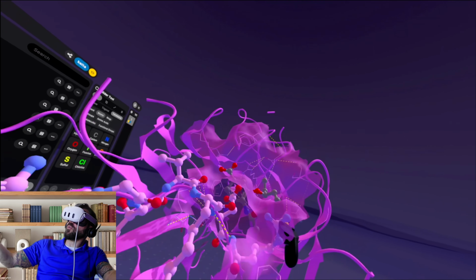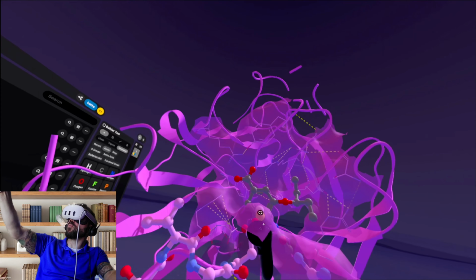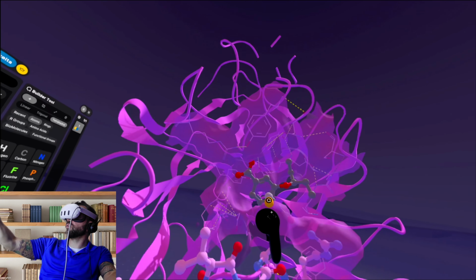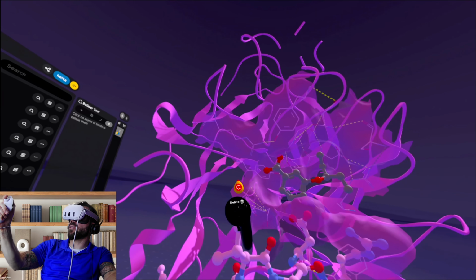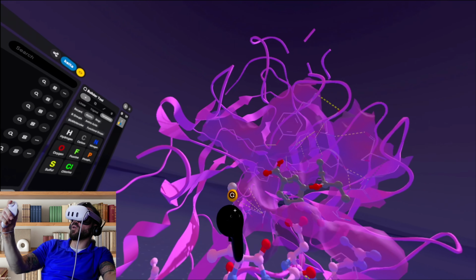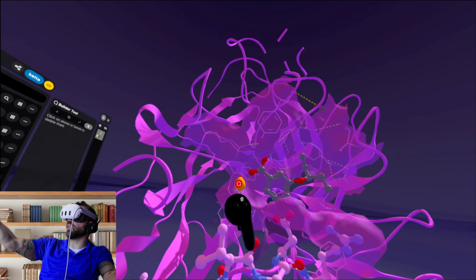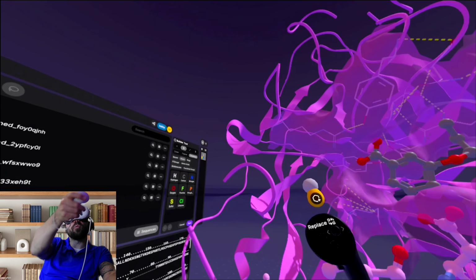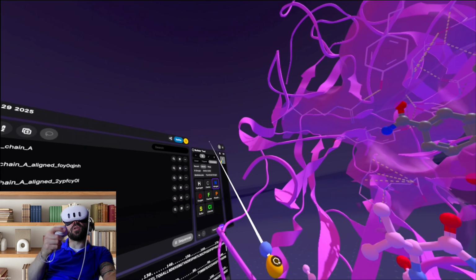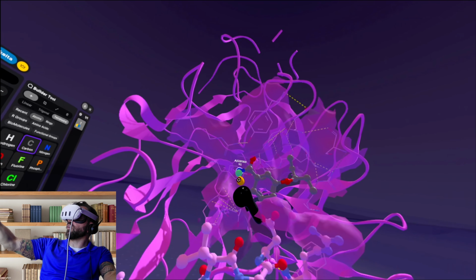Which is really far away. So we're just going to build off of this. We can make an amide bond here, probably. So let's pull up a nitrogen, and we want to go to replace. Right now we start on build, but using our thumbstick we can go to replace, we can edit bonds, or we can delete atoms if we want to. But we want to replace this oxygen with the nitrogen, and then we're going to go back to build, and let's build off of this nitrogen.